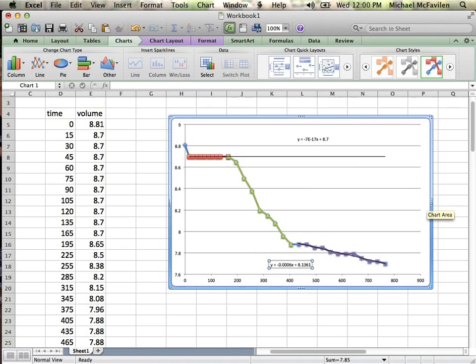If you guys remember before, we had the data set where we picked our volumes and we said it was the distance between these 2 points. We did something along these lines, right? We talked about it in recitation. To get that figured out, what we would do is pick the time for each of those 3 points.